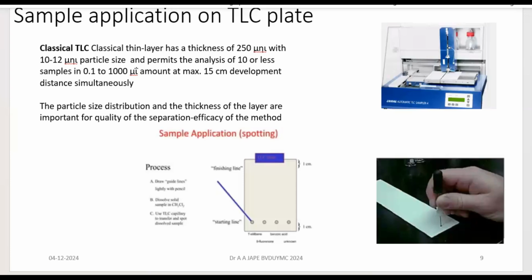So once these TLC plates you are going to prepare, or you are going to buy the commercially available ones, which are also called polyamide layer sheets, which consist of polycaprolactam and are coated on both the sides of the solvent resistant polyester sheets. They are also available. So a variety of ready to use TLC plates are there on the market. You have to choose the right one. And of course, cost effectivity is to be taken into consideration.